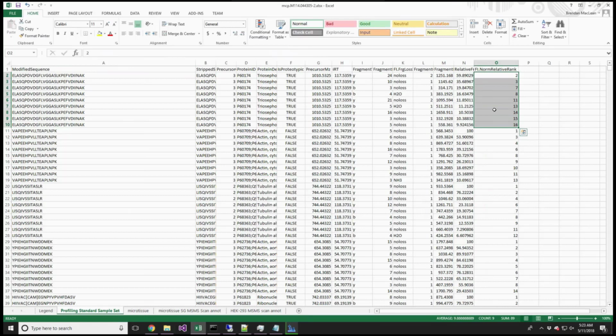So yeah, but you notice that this first peptide doesn't include a value that's 100 or 1. What? Yeah, but number 11 is the next one. So yeah, no. Here's what I think is going on.